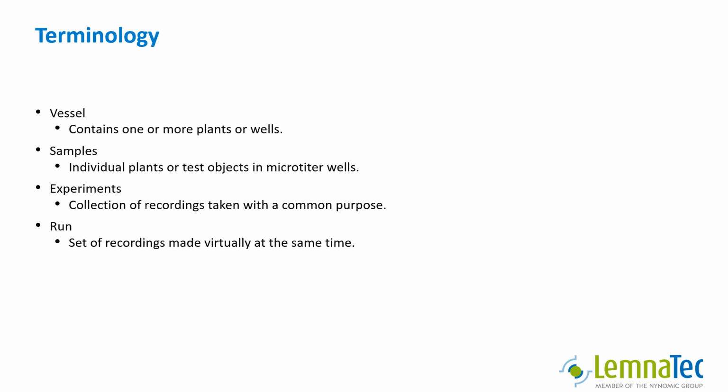Therefore, all recordings done virtually at the same time belong to the same run. In other words, a run contains all recordings made by pressing a single button. With large systems such as PhenoExpert HT with its conveyor, a run will contain multiple recordings of multiple vessels. This may go into the hundreds or thousands for really large systems. On the other hand, with small systems, a run may contain just a single recording. Finally, a snapshot contains all recordings made of the same vessel in the same run.